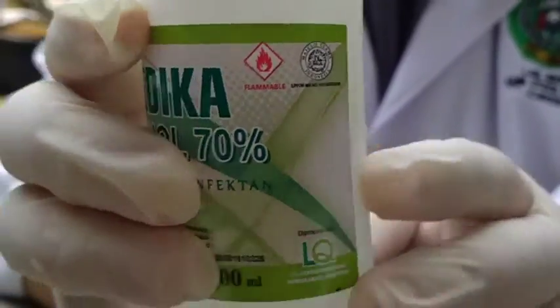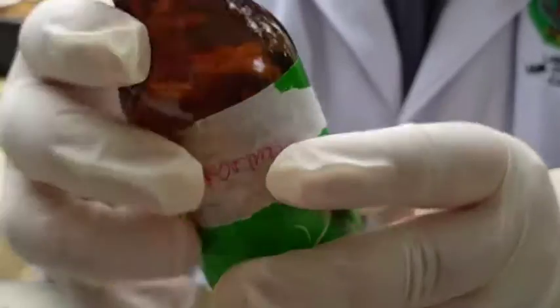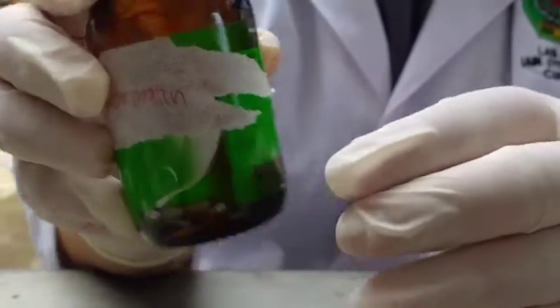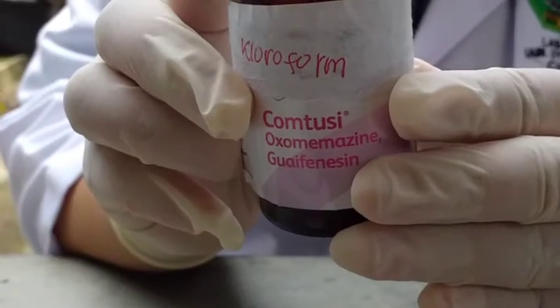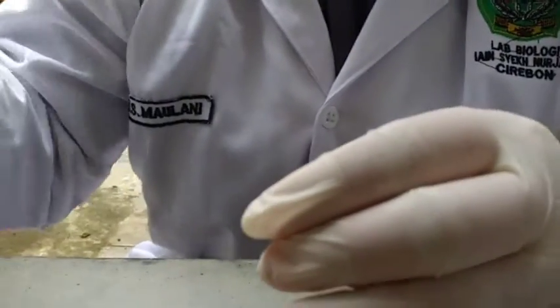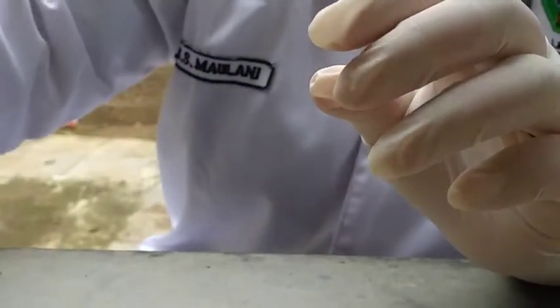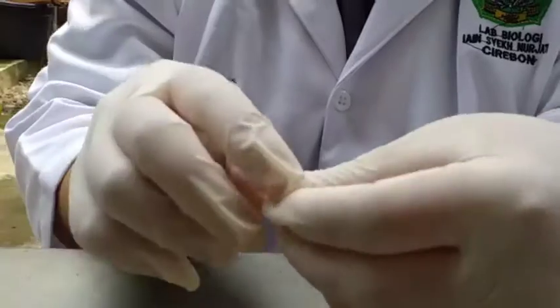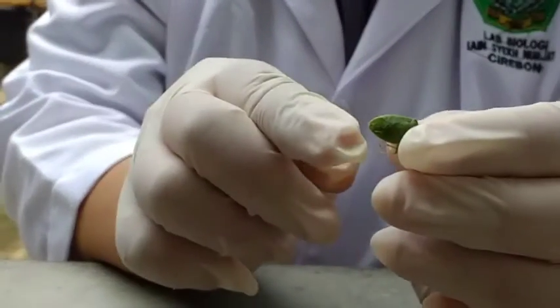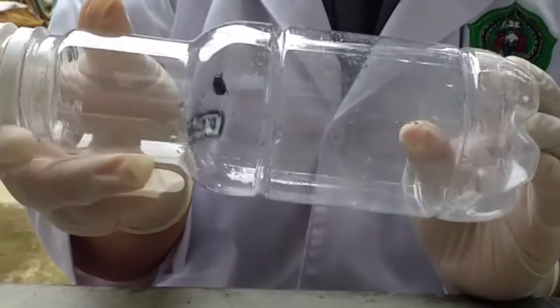Di sini saya memakai alkohol 70%, kemudian ada formalin 5%, klorofoam, kapas, spesimen, dan botol.